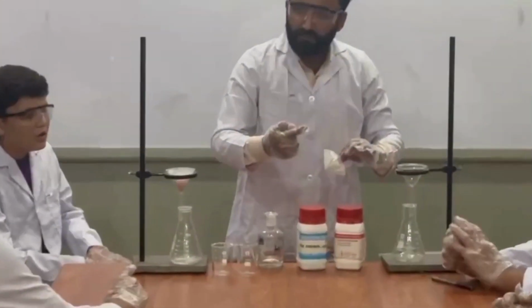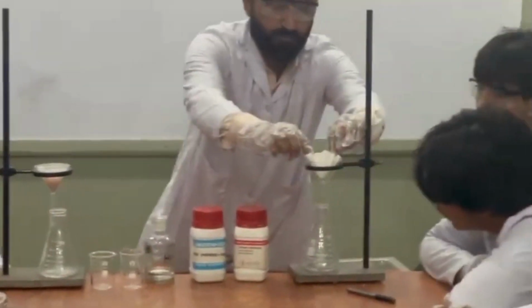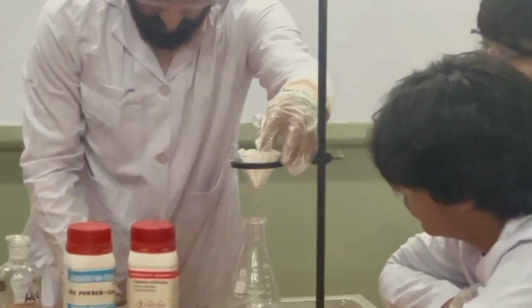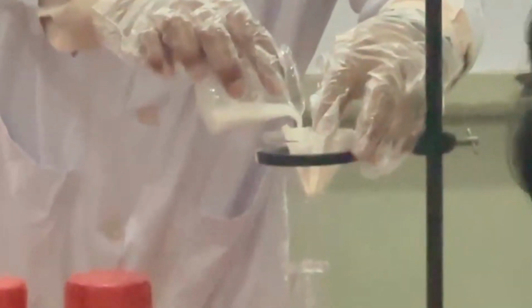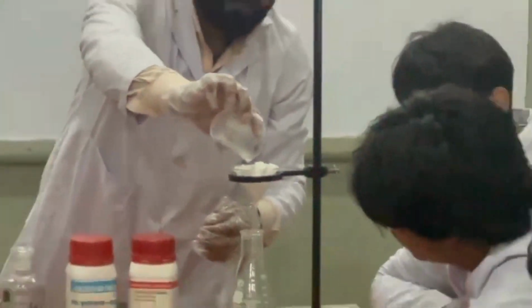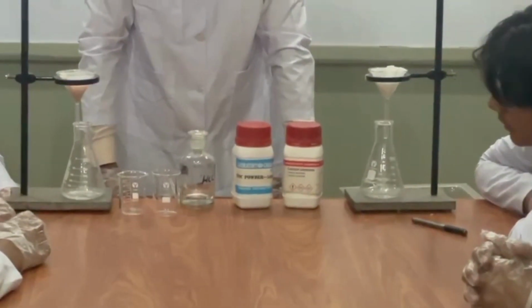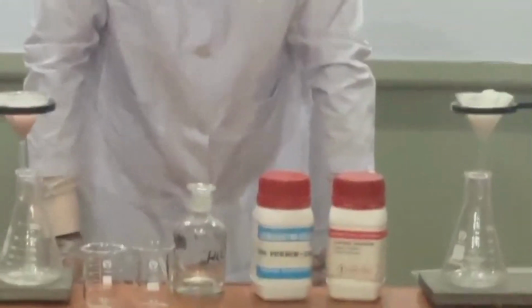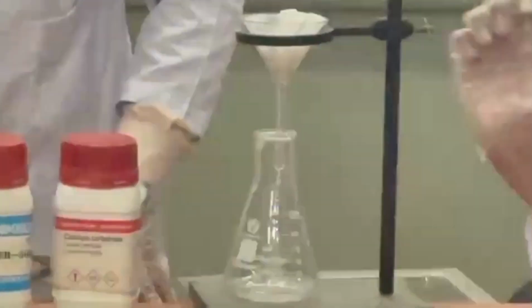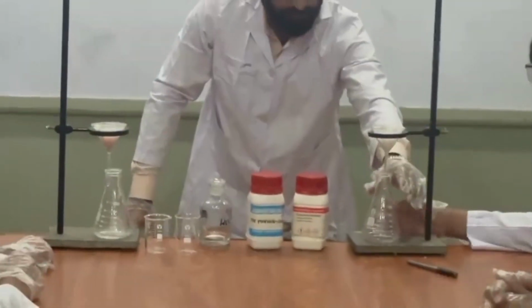Please observe the rate of filtration in that solution. Sir, it is slow. Now observe the rate of filtration. It will take this much time. It should be fast because we are using fluted filter paper. Okay, let's pour it. Sir, it is much faster. Its rate is faster than the previous solution. Okay, please stop.